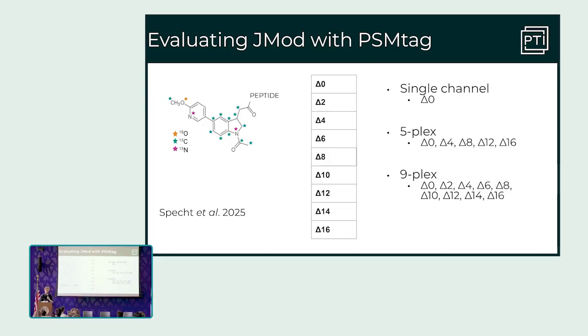So as was alluded to earlier as well, typically in DIA mass spectrometry, when we're multiplexing, we ensure that there are 4 Daltons between each channel, each sample. And this is to account for the isotopic overlap. It makes our lives a lot simpler, and most algorithms can work with the data if there's little to no overlap between these channels. And 4 Daltons achieves that. But if we were able to relax that constraint, and develop models that could work even if we just relax that to 2 Daltons, we would get almost double the effective throughput for the same molecule.